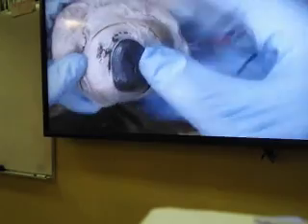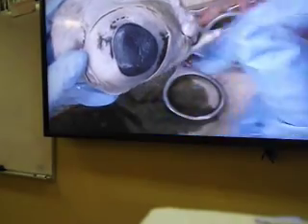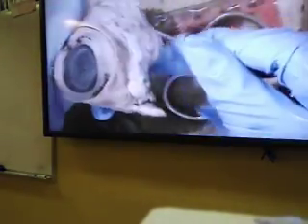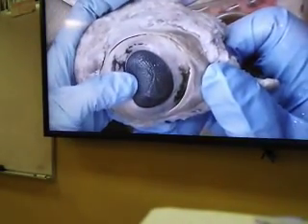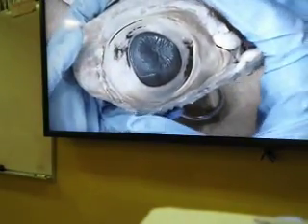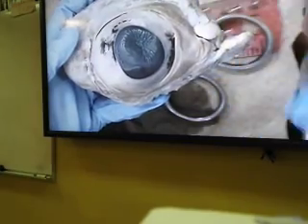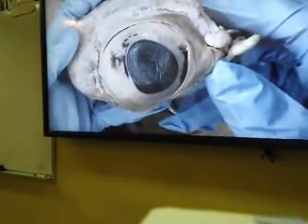So I know this structure, which is very opaque, is called cornea, through which light will first pass through, and so that has to be the front of the eye. Now we see the cornea is opaque in here. However, in living condition our cornea is not opaque, it's actually transparent. So when you keep the eyeball in solution for a long time, the cornea will turn opaque. But in living condition, for light to pass through, the cornea has to be transparent, which our corneas are.